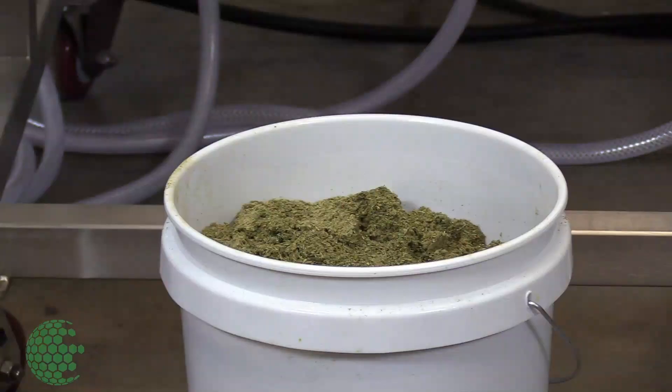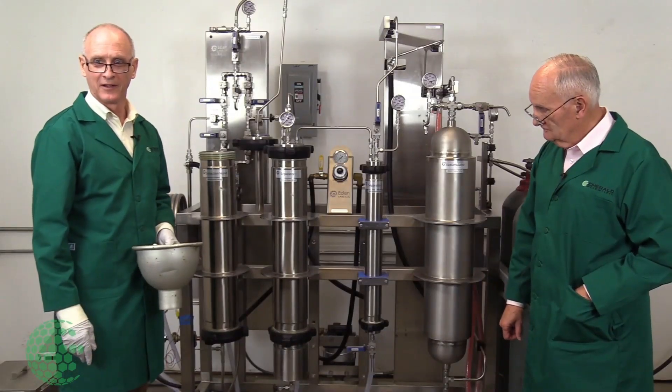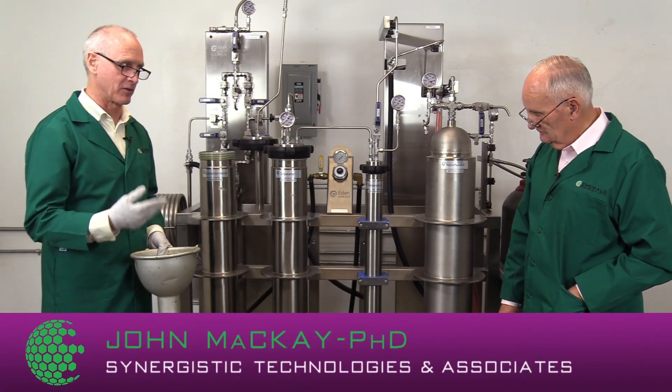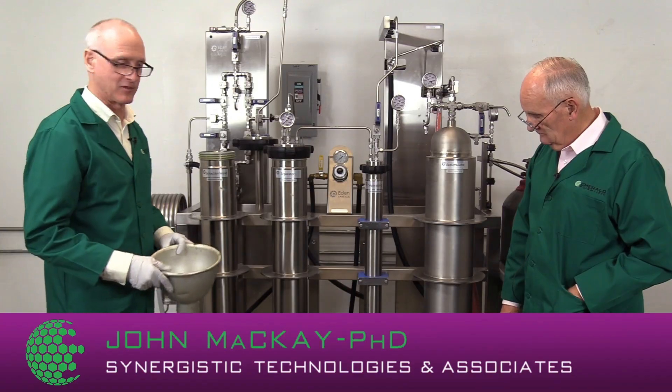One of the things that we have seen with the material is we've also taken a sample of this material to know what the ratio of the cannabinoids are before we place it in. So that'll help us afterwards when we do our mass balancing.